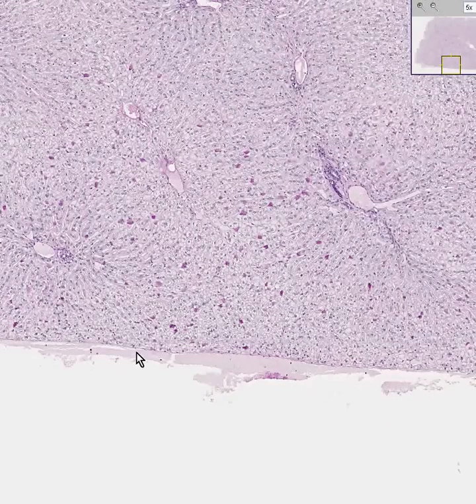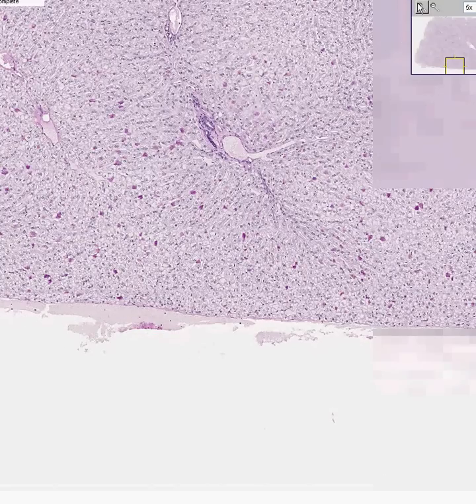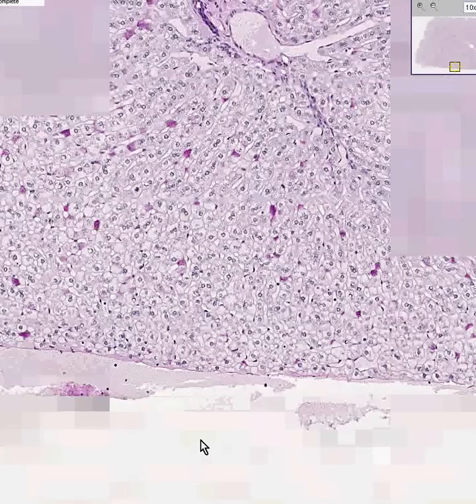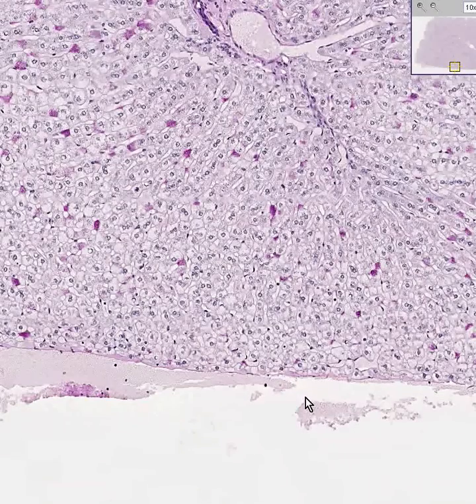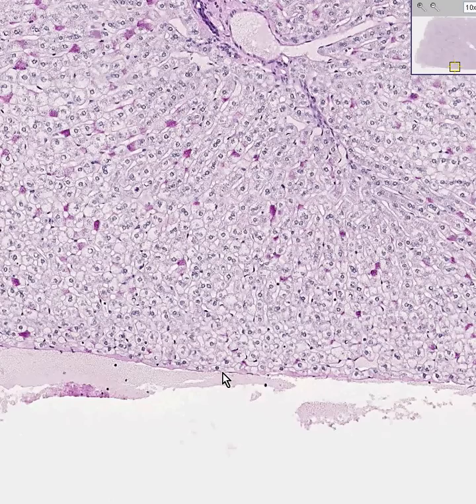Because the liver is intraperitoneal, if you saw a few mesothelial cells on the very surface of this connective tissue, perhaps here, then you can guess that this was the capsule of the liver, which is also the visceral peritoneum of the liver.